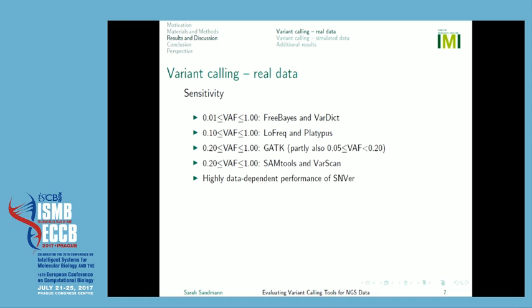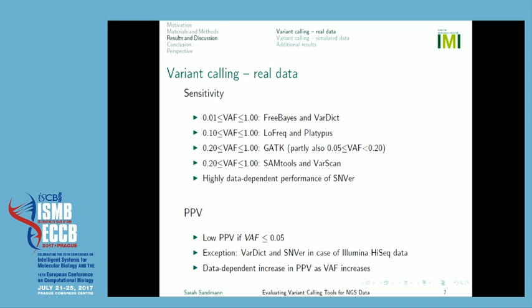Now, when you go for the PPV, you, of course, expect to see low PPVs when you go for low-frequency variants, and this is what we also could observe.